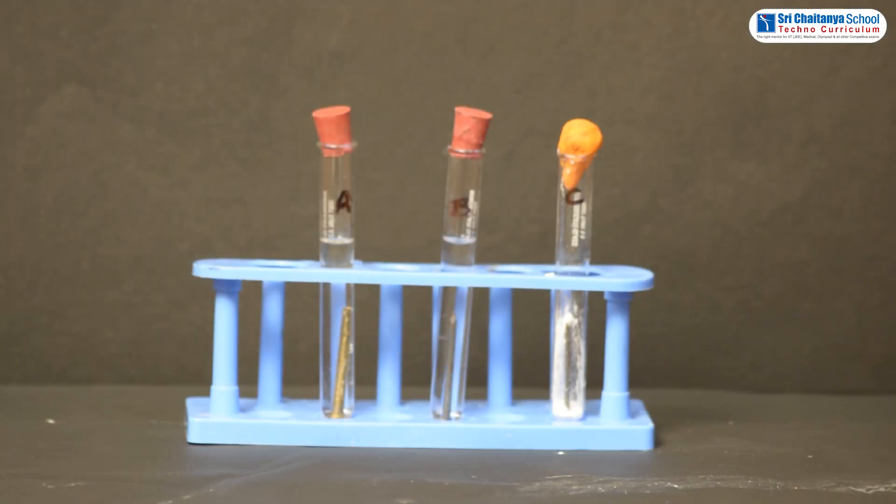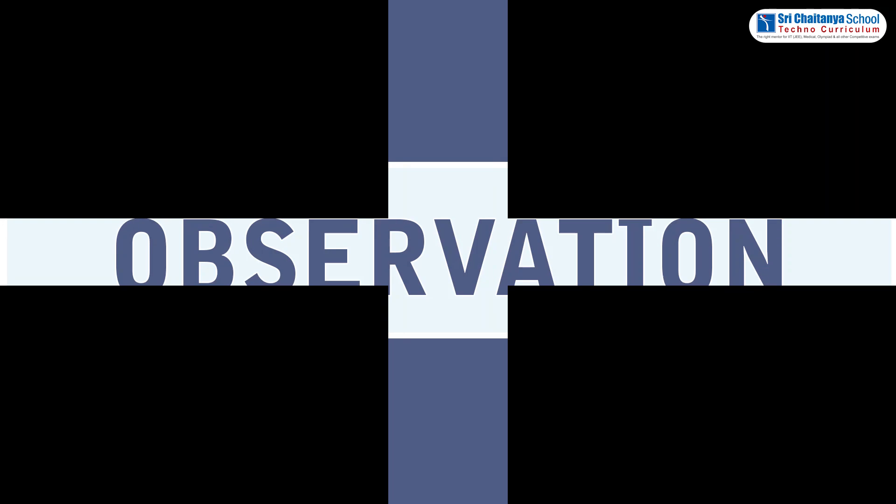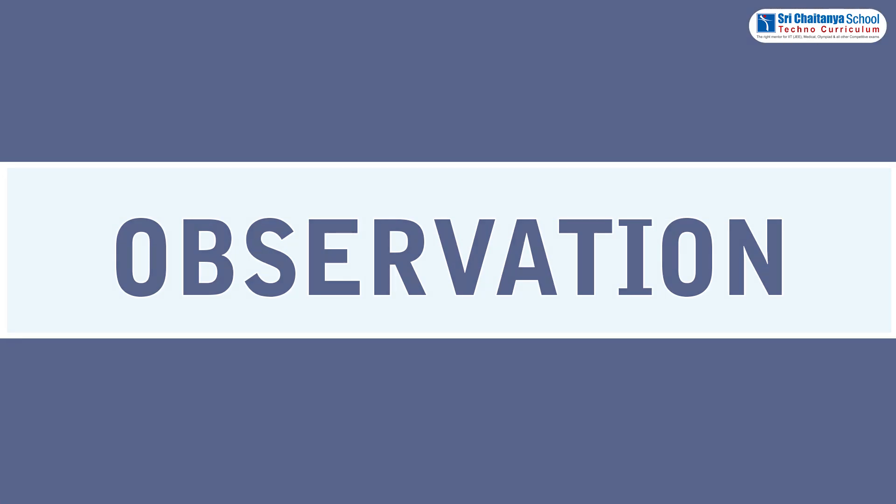Leave these test tubes for a few days and observe it. What did you observe my dear children? Observation.